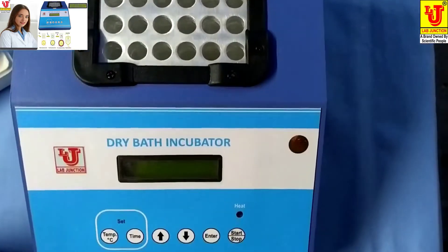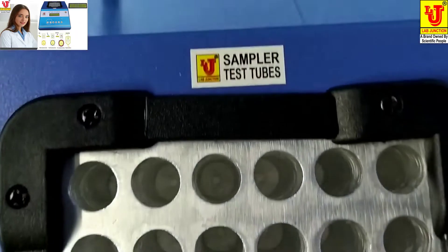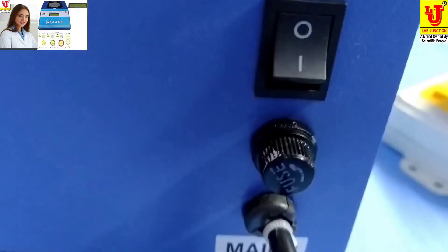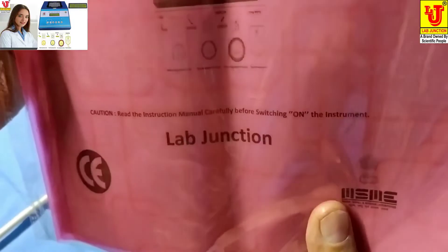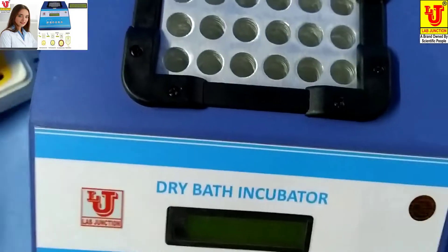This model is LJ352. This is the front view, side views, and back view. On the back side, two controls are there: an on/off control and a fuse facility. With this instrument, the accessories include an instruction manual, dust cover, and warranty card.